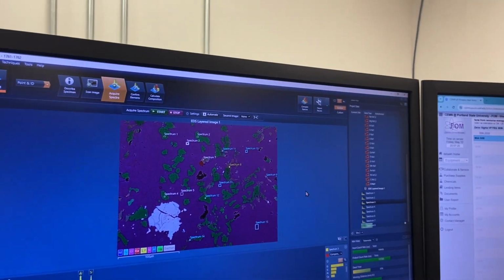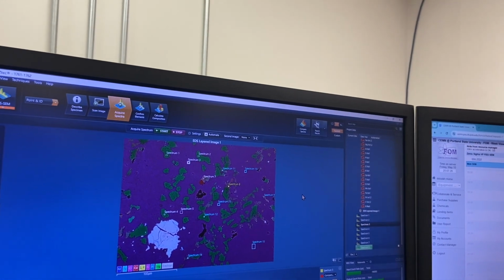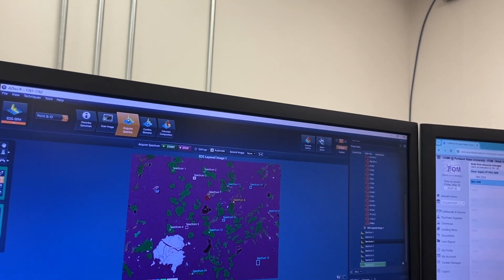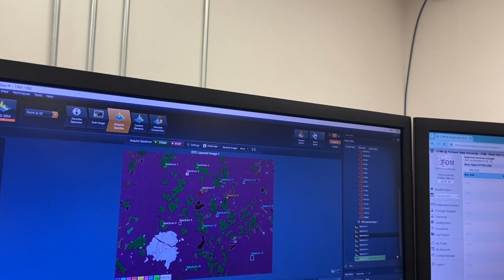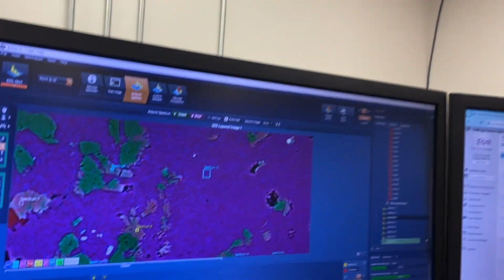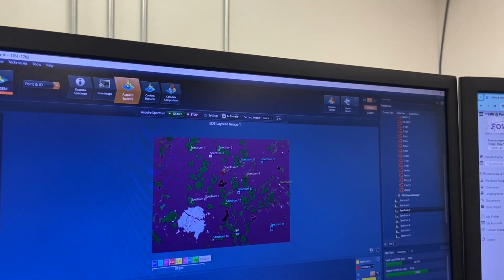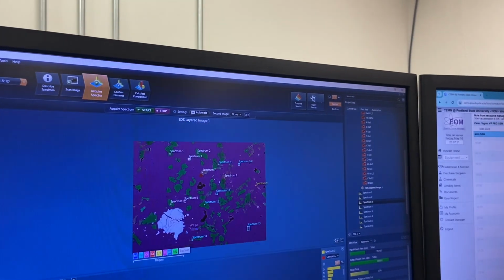Now, could there be something on Earth that mimics a composition like this? Normally I'd say, yeah, you could get feldspar with AN94 on Earth. You go to a terrestrial massif, right? You have those anorthosite layers. But then you get olivine in them like this, and that's a little weird. You get chromites. But then you get stuff like this, and it's like, wait, that's iron sulfide. That's troilite. You don't get those in Earth rocks, right? You get other kinds of sulfides like pyrite. So when I see all this together, I know right away this is a lunar meteorite.